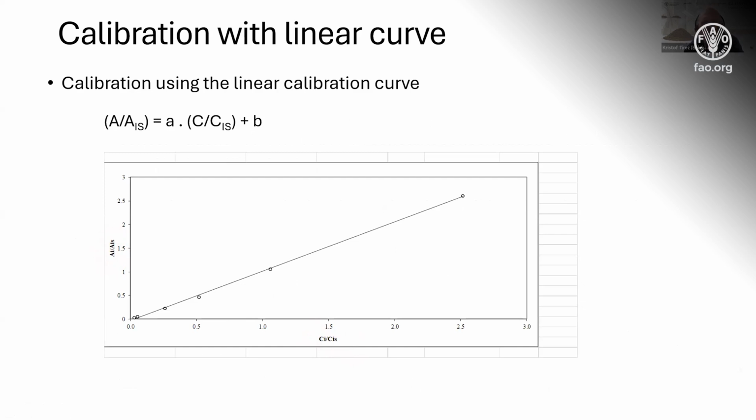Hendrik, could you comment how the peak area is calculated, or how it's done and how you have to do it? That is done by integration of the peak. That means that the baseline, I don't have a picture of this, but normally this is automatically done in the software. And in general, you don't have to do a lot of corrections.